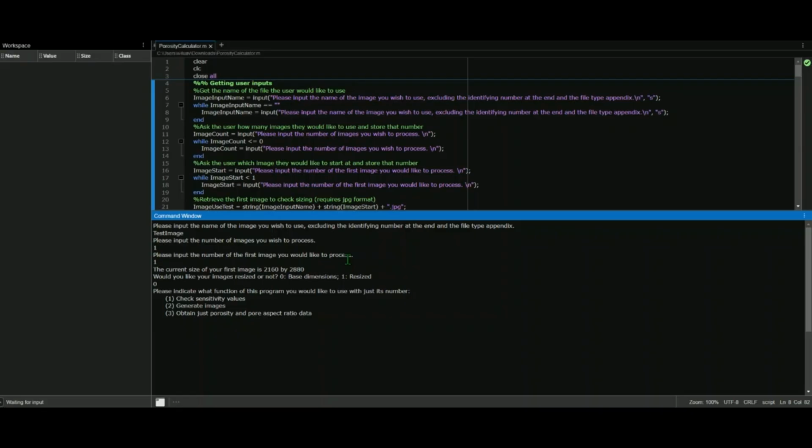I'll describe that more in detail in a minute, from 1 to 255. So there's 255 rows in that Excel spreadsheet. I'll show it at the end. And it will run through every single one of those numbers and get the different values for the porosity. So what that means is this program is going to take the image, which I can show.